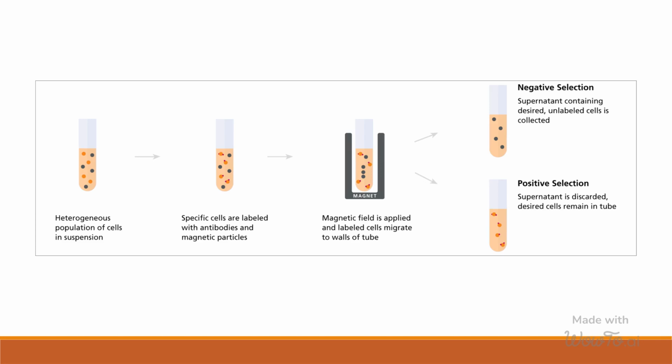This is a schematic representation of the principle of immunomagnetic separation. In the first tube is a solution containing the antigen such as virus. Antibodies specific to the virus are added to this solution. These antibodies, which have been attached chemically to a paramagnetic particle such as magnetite, then bind the virus. When a magnet is applied to the solution, the magnetic particle is attracted to the magnet along with the attached antigen. Immunomagnetic separation is a valuable tool for concentrating and purifying antigens from complex solutions.